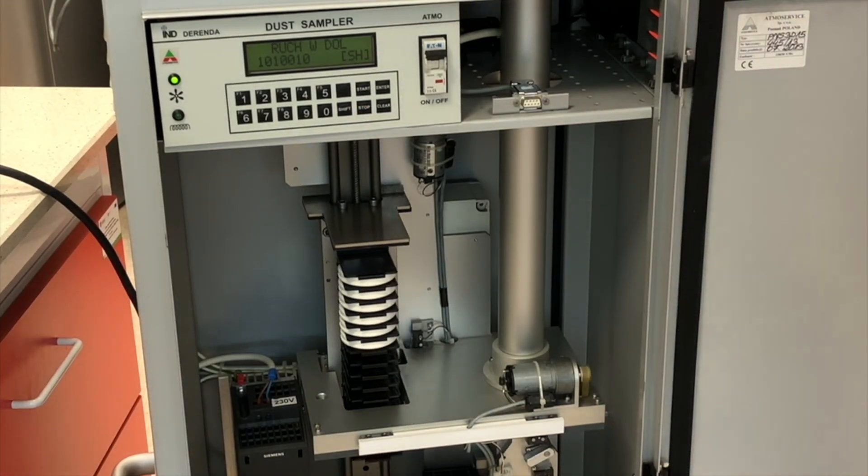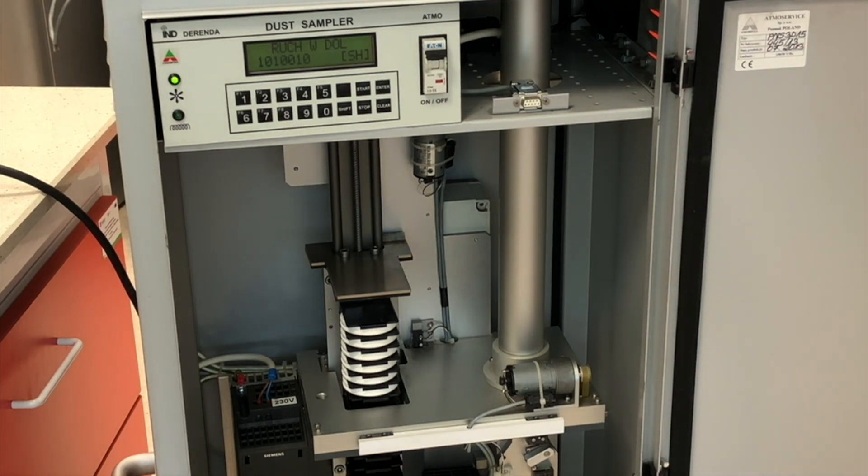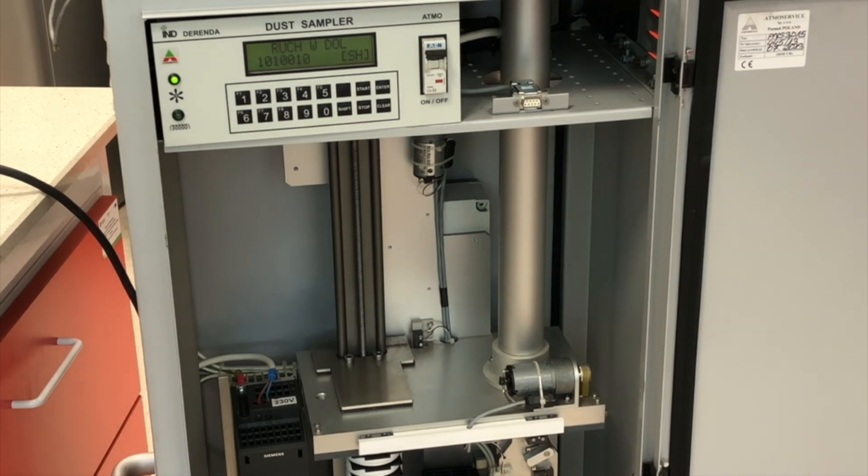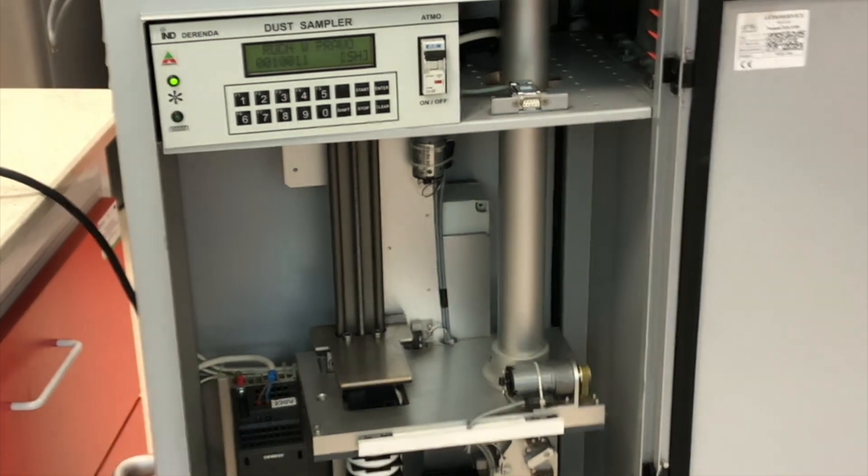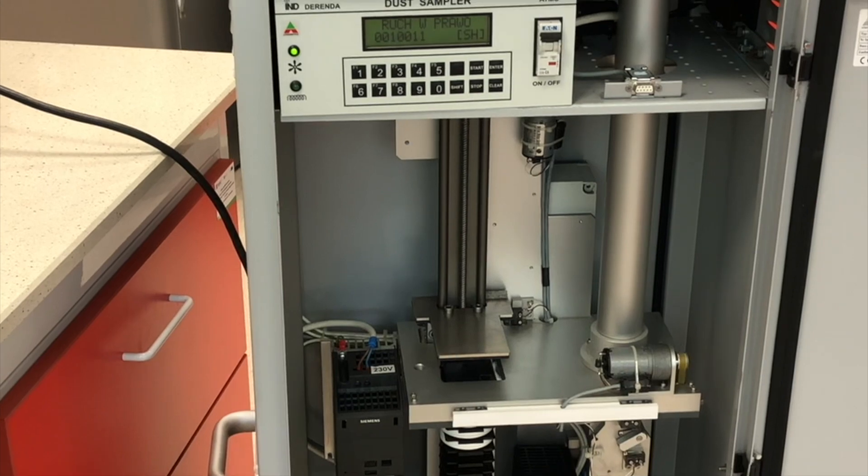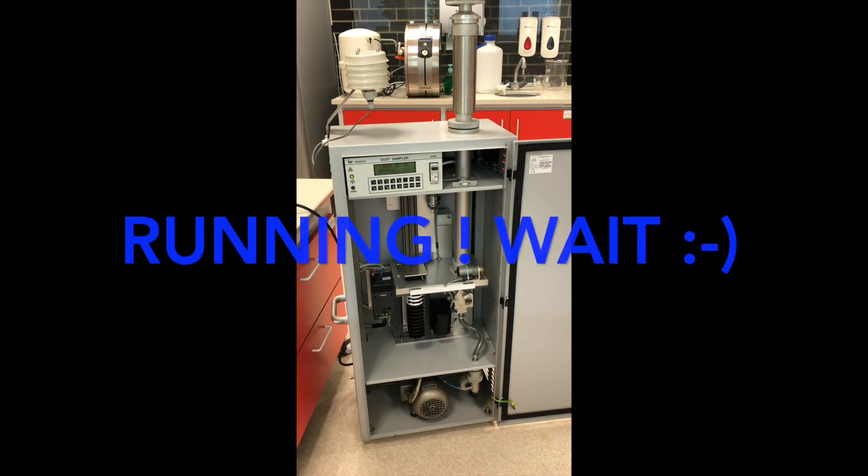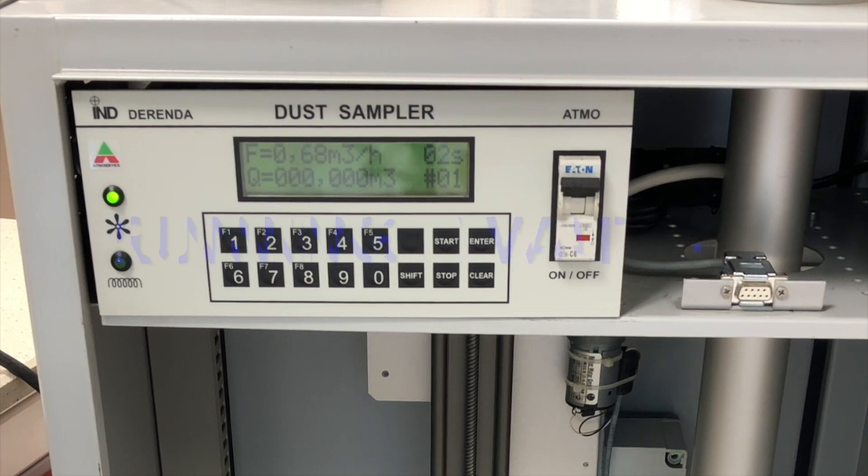Now the cassette goes down and the sampler takes the filter. And it will start to work. The important thing in the sampler is the flow. It has to rise to 2.3 cubic meter per hour.